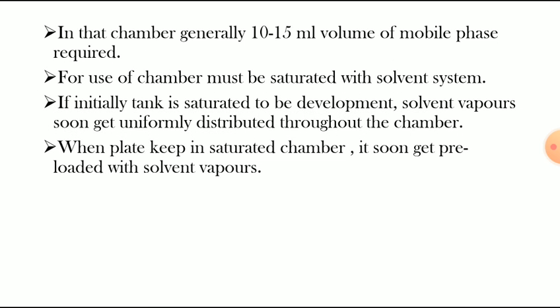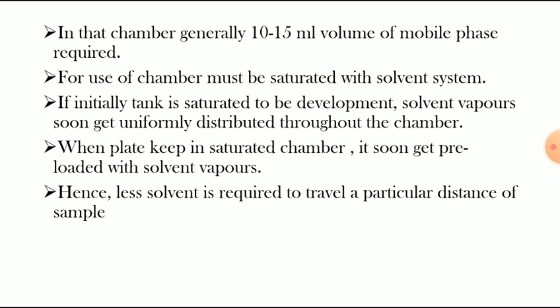When the plate is kept in a saturated chamber, it soon gets pre-loaded with solvent vapors. Hence less solvent is required to travel a particular distance of sample, or you can say it can easily separate out the sample components. As a result we get good RF values. When we do the above procedure, we will get good RF values.